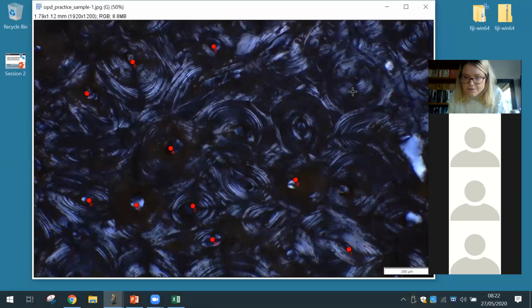So I think we've got, that one's definitely fragmented. This one looks like it's eaten away. This one looks like it's been remodeled here. This one looks remodeled here. This one is a very good example here. You can see, this one looks like it's a little bit fragmented. I'm not sure about that one. Possibly this one.